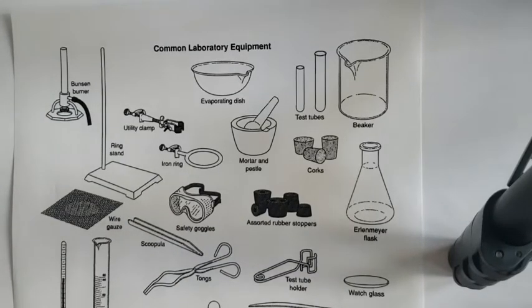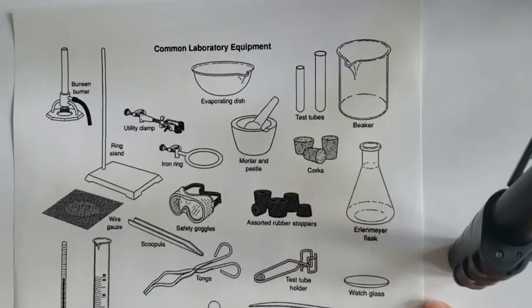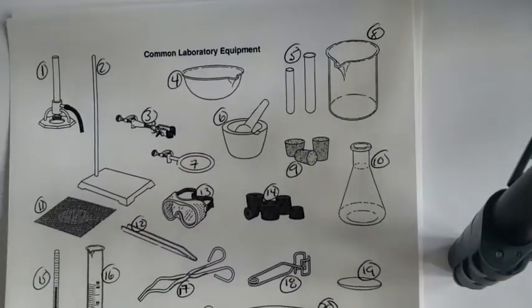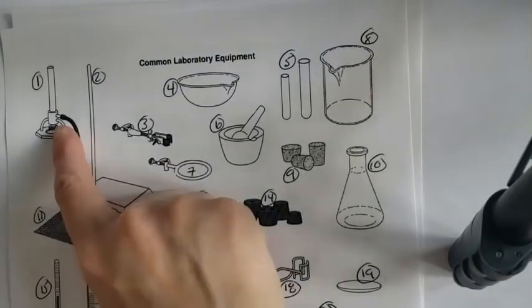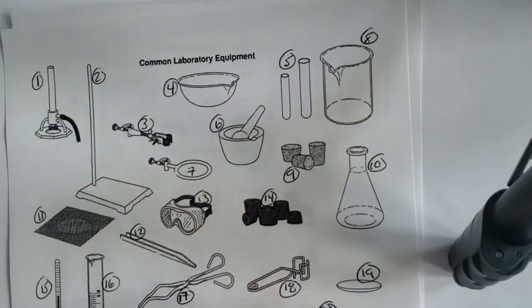All right, so this is actually going to be your very first assignment. And right here, this is the page with all the answers on it. I'm actually not going to post this one. What you'll see under assignments is this page here. It says all the different lab equipment, they're all numbered. Okay, so number one is this one.